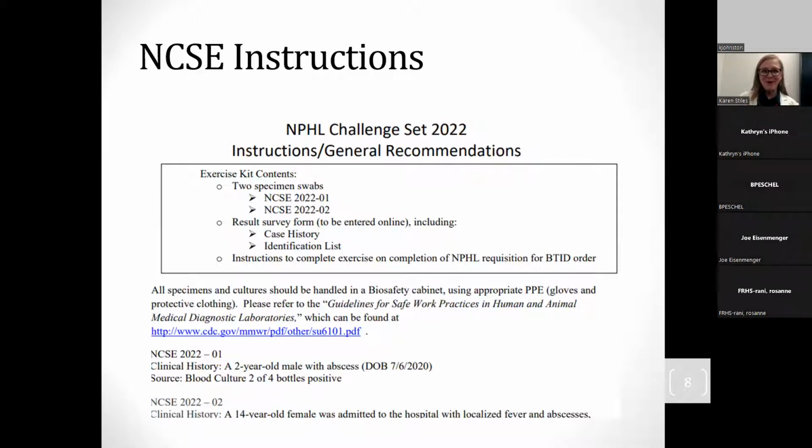Obviously, you know that in our BSL-3, what we have here, we literally have PAPRs, which is the whole headpiece, and oxygen is provided to them. Obviously, you don't have to go to that degree, but we do ask that you kind of beef up your PPE as you work into that, especially if you are aware of any specimens being more dangerous.